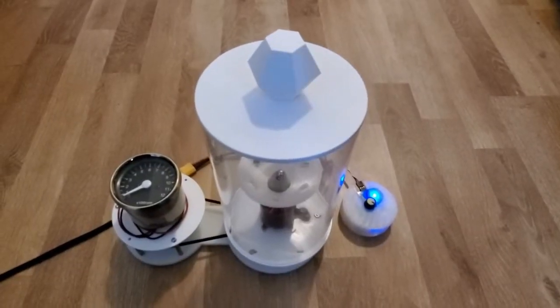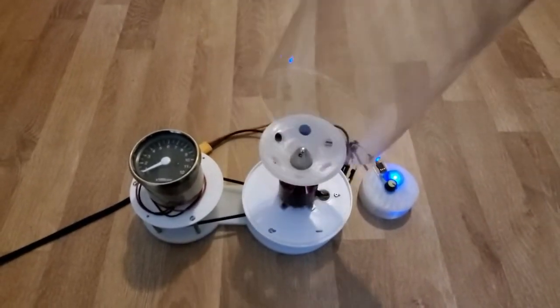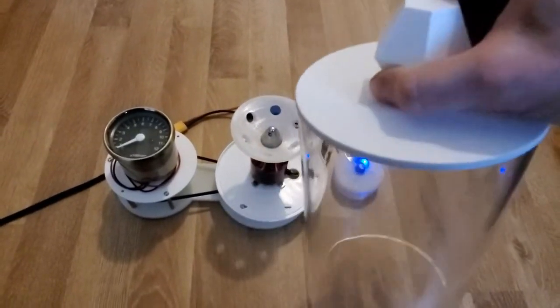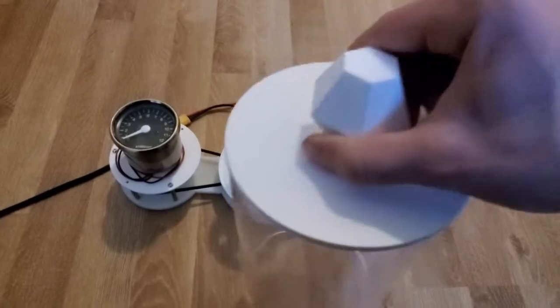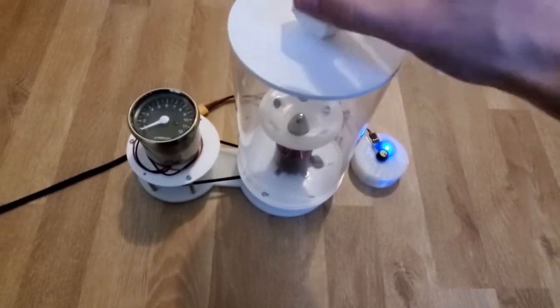One of the major changes, as you might see, is this shield. You now have an acrylic shield to protect you. It also has a lid — easy to take on and off with this knob — and just slides in like that.